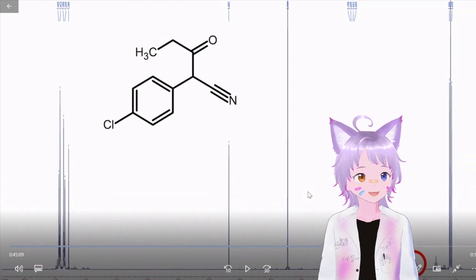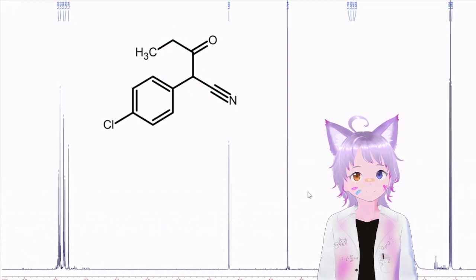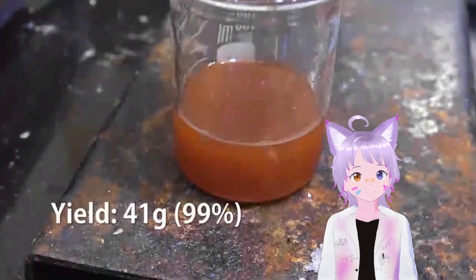Just keep playing. Over here is water. For obvious reasons, we have a lot of water contamination. Overall, this spectrum pretty much confirms that we have our desired product. Our yield is 41 grams or 99%.